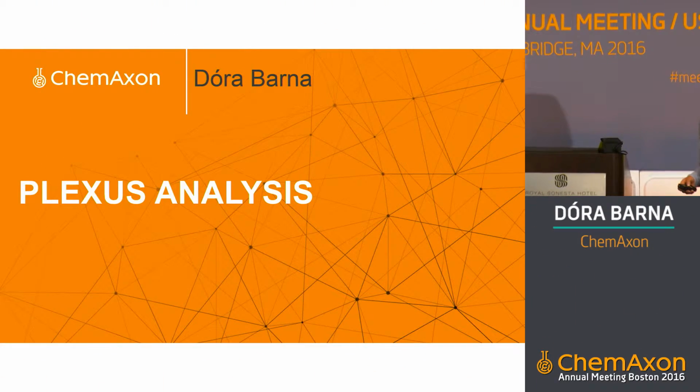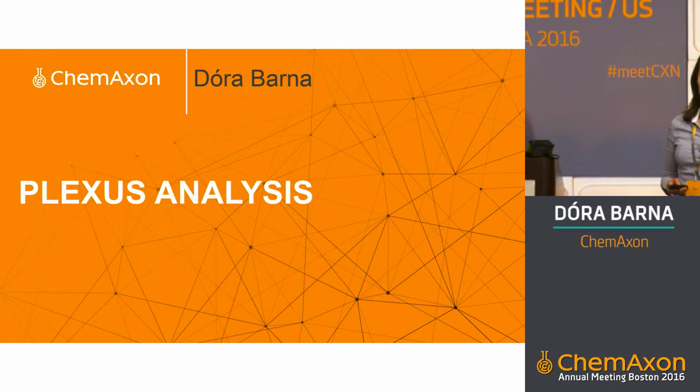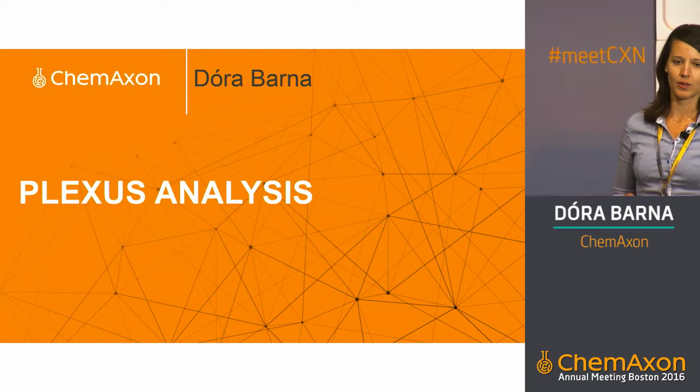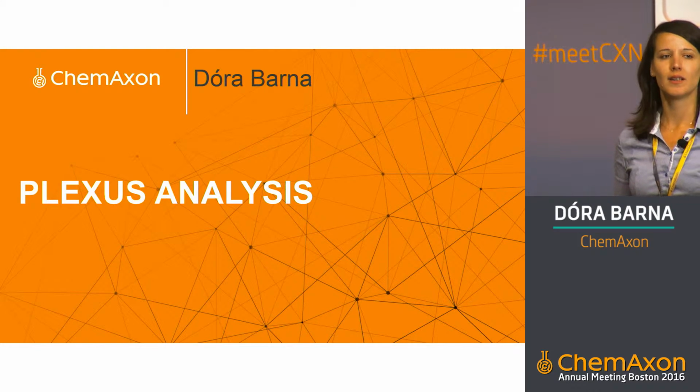And in the next couple of minutes, I would like to give you a summary about Plexus Analysis, which is a quite new, recently released member of the Plexus suite. And in the end, I would like to give you a bit more detail about the latest feature we added to our software.